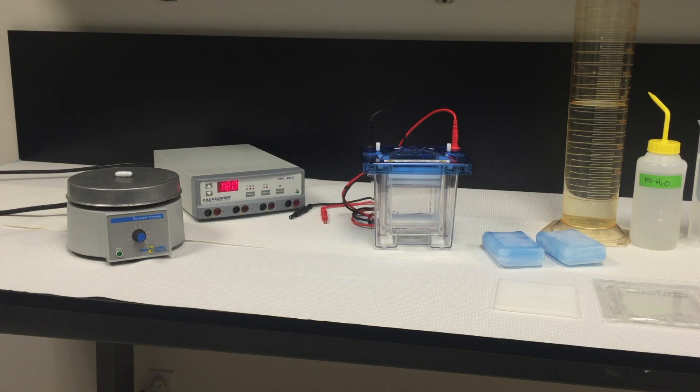Vertical mini gel electrophoresis in the DCX700 Dual Cool using ClearPage precast gels.